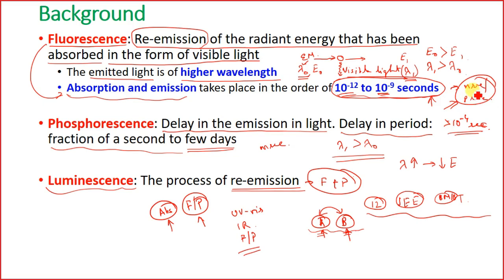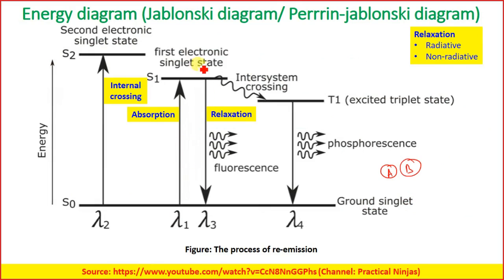The reaction the fluorophores give is very fast. It is absorbing and almost simultaneously releasing the energy. It immediately goes to the higher state, and then immediately comes down. And over here also, the movement happens very fast.